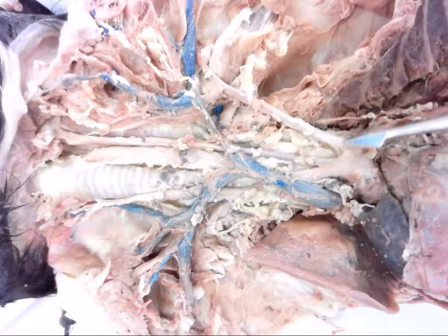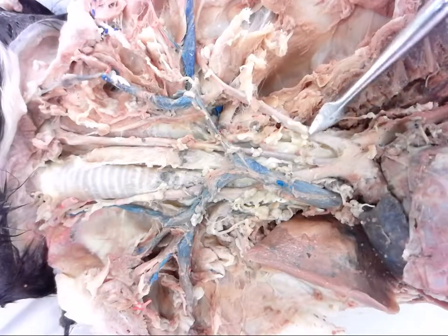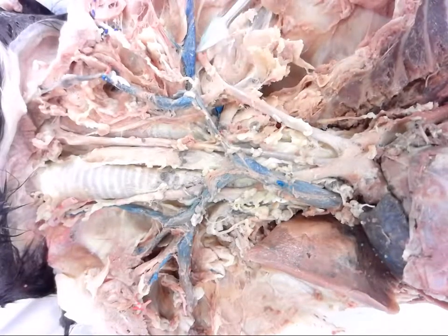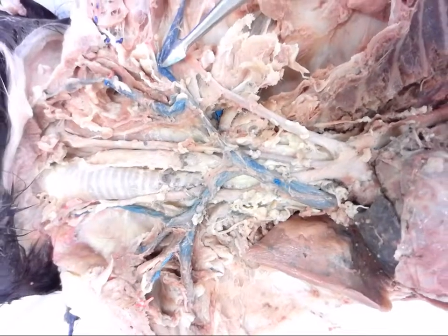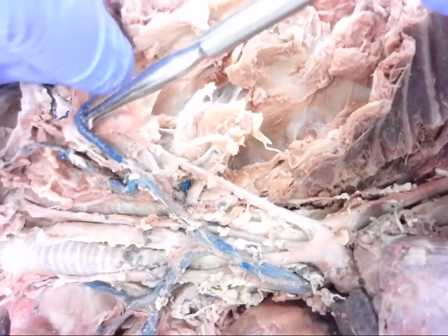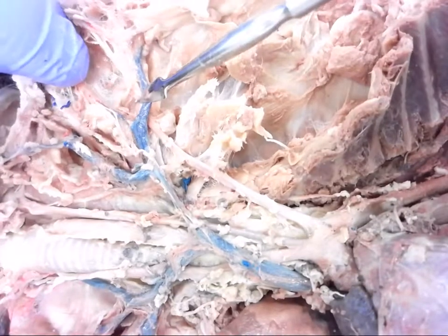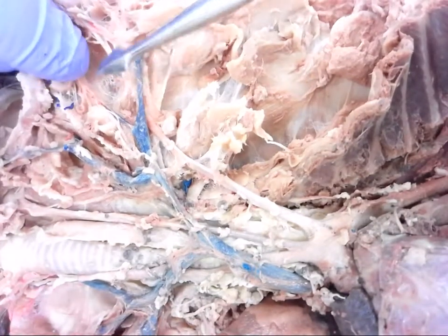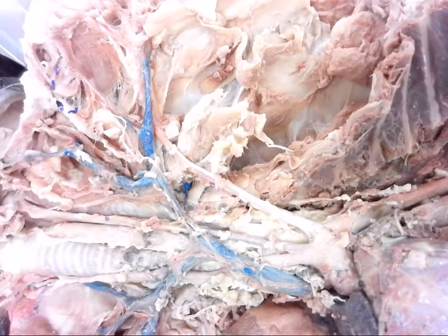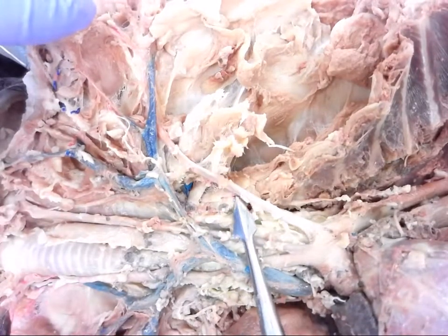All right. And then our next branch we see here, this is your left subclavian. And the left subclavian is going to come up here, and this one actually is going to go under the clavicle, which has been removed. You'll see a little bit better, move up just a little bit here, a little bit further along you can follow this. So as it goes out to the arm, it is going to have some branches. You'll see a couple of things come off, minor things that usually are going to supply the rib cage and a little bit more up in the shoulder. So there is your left subclavian.